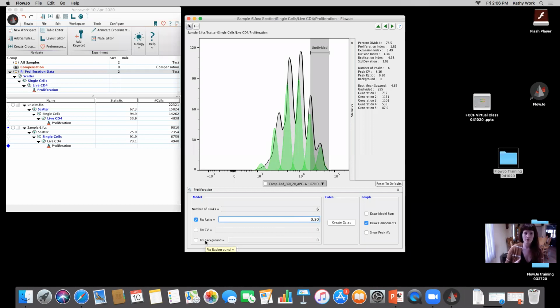We have a couple of different fluorochromes in here, and you might see a little bit of spreading for us to define where our negative and our positive are. And if I had a sample that had everything in it with the exception of this eFluor 670, I'd be able to look at that population and gate on the negative there and look at the statistics and get an idea of the background.